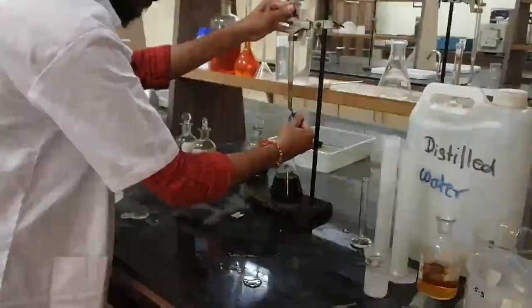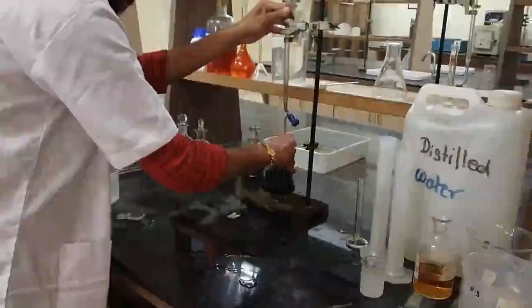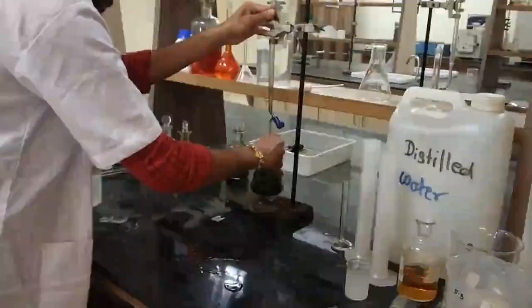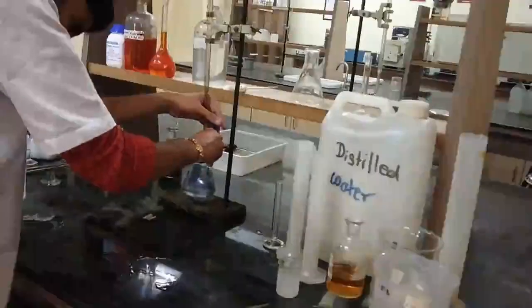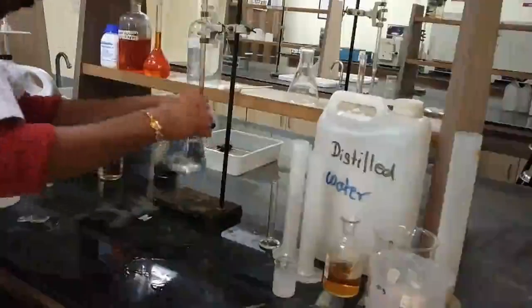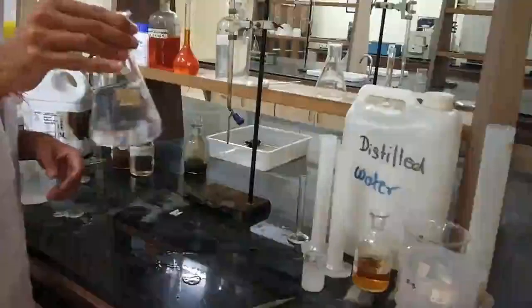Drop by drop addition and simultaneously shaking of the conical flask is to be done. Note the color change. Here it is turning slightly colorless. It was faint blue. Now you can see it has turned totally colorless.